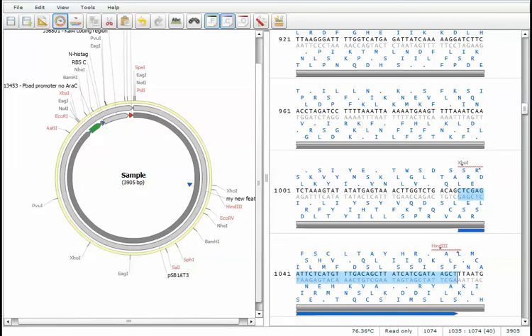I would encourage you. I just only had time to take a quick look at some of the things that came in today, but take a look at vector editor software, and I really think this might be useful for people who are teaching students to give them some of the conceptual features of the things that you might want to illustrate here. Try it out.